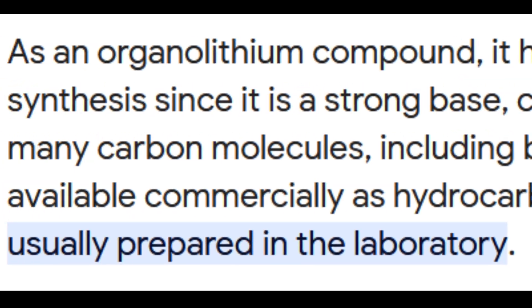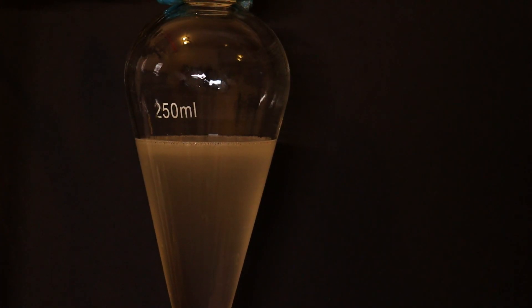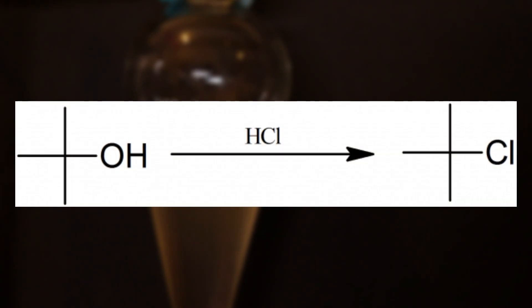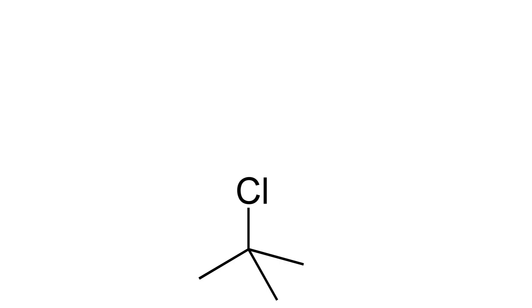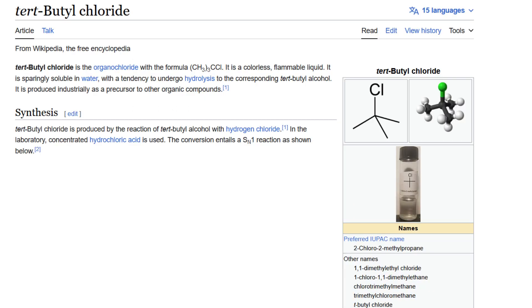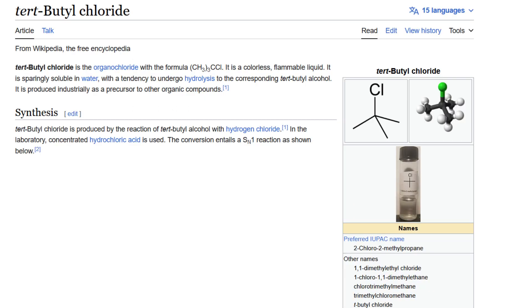I've read that it's not usually synthesized in the lab, but why not try it? The synthesis path starts with some tertiary butanol and hydrochloric acid, because we need to make tertiary butyl chloride, an organic chloride with a smell reminiscent of mint.